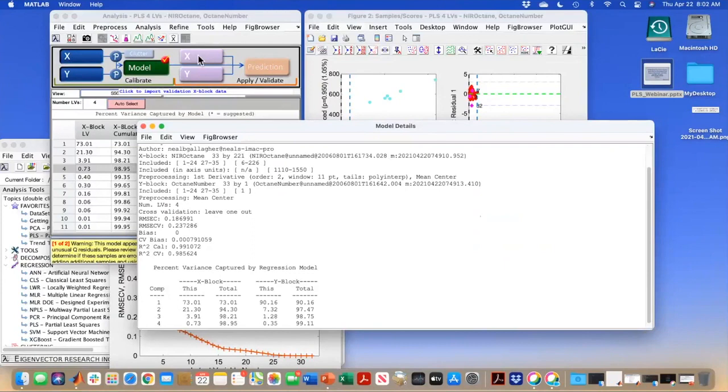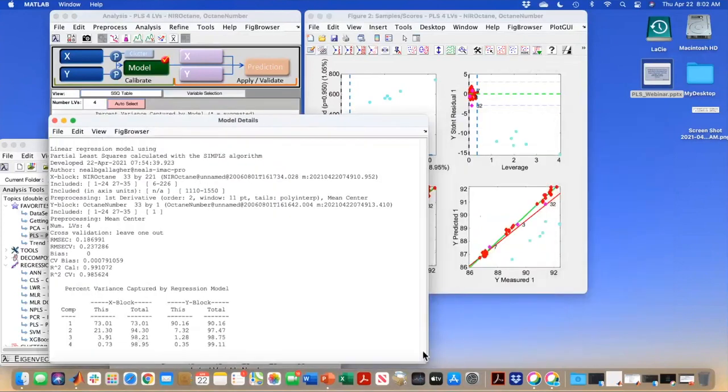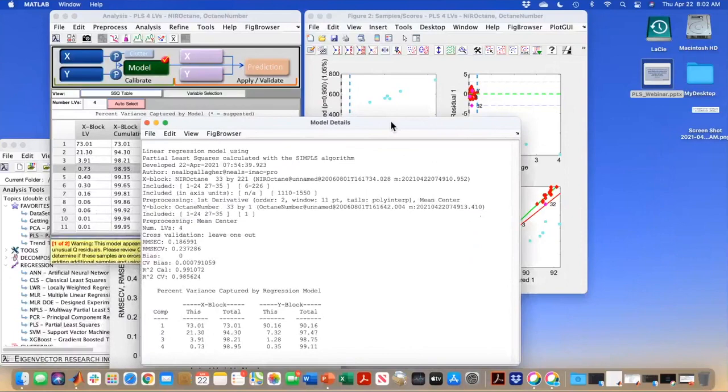Let's see. For PLS-DA, variance in Y block captured by model can be quite low. So we're not really talking about PLS-DA classification here. I don't really want to take a stab at that, but we do have a nice webinar on DA. And you don't cross-validate on variance captured on Y. That's not our interest. It's on the classification part, so it's different.